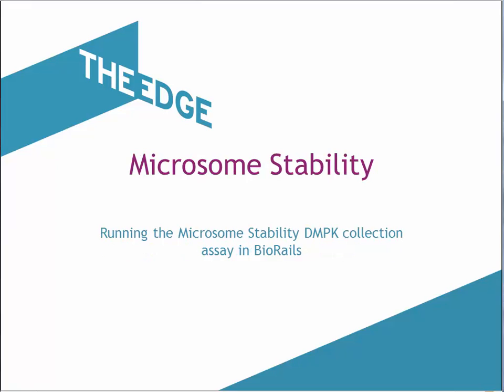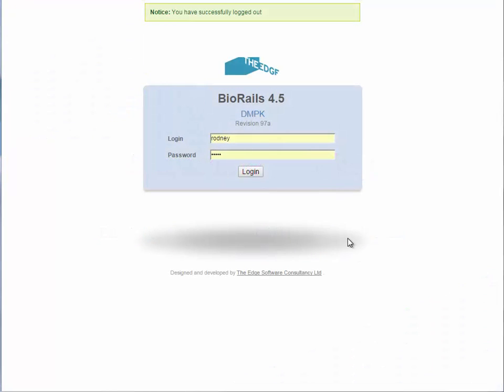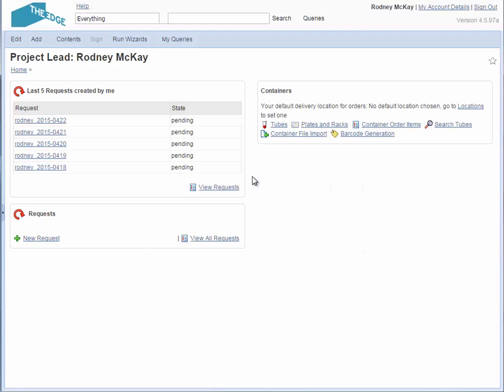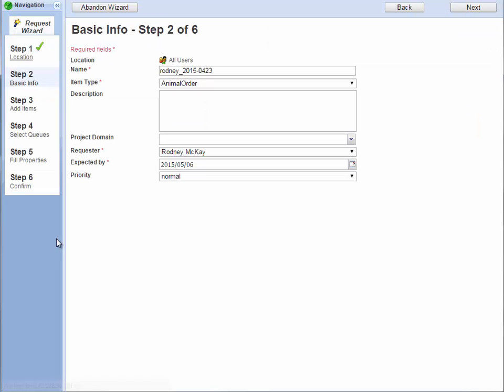This is a demonstration of the microsome stability assay run in BioRails. I'm logging in as Rodney McKay. He is the chemist responsible for requesting assays to be carried out on samples.